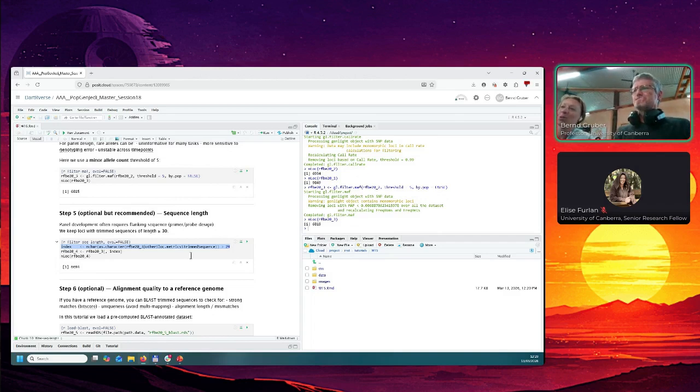This was more, it's not necessarily low quality data. You can still get really good quality SNPs. It's just where the restriction enzymes cut. Yeah, my mistake. But the reason we're filtering here is because we need to be putting primers in either side of our SNP. And so very short fragments aren't going to allow you to do that.